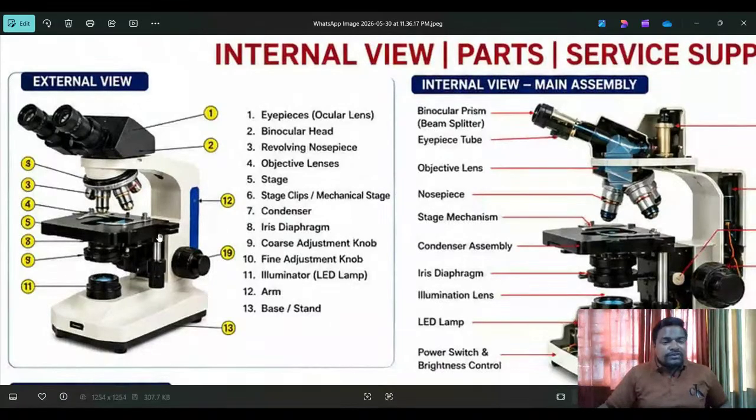We are not in front of the medical equipment right now, but we work as biomedical engineers in India, in any state, in any country. We provide services for that purpose. When I explain, you should think as if you are in front of the machine and I am giving you advice.